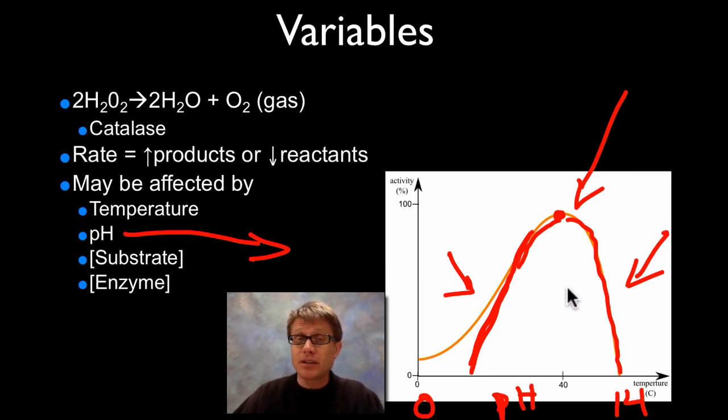And so now you know a little bit about enzymes, how we set that up, how we do that lab, and so I hope that's helpful.